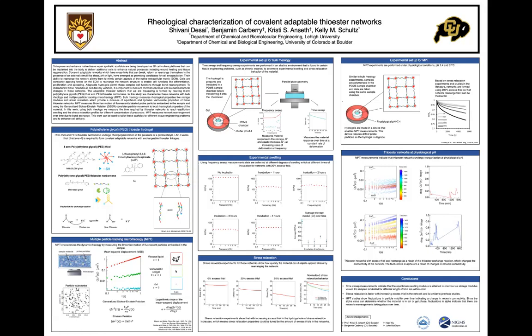We first use bulk rheology to characterize the material, where the usual principle of bulk rheology is to apply deformation to the material and measure response. It could be either over time, or we could apply deformation at different rate and then measure the properties like storage modulus. We first measured equilibrium swelling in the material by frequency sweep measurements.